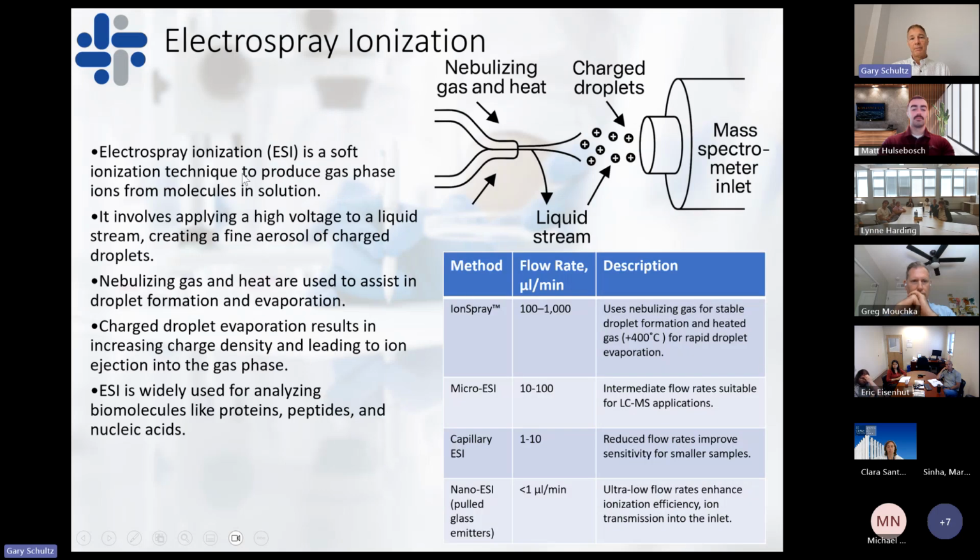So electrospray ionization itself is considered a soft ionization technique. In positive ion electrospray ionization, it typically will attach a proton to the molecule. And so, of course, mass spectrometers detect mass to charge species. By placing those protons onto these molecules, typically we'll measure the molecular ion. So it'd be the molecular weight plus one proton for a singly charged ion.